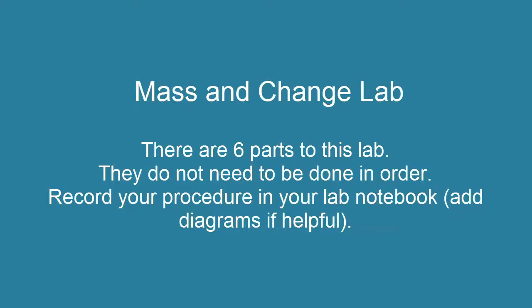This is the pre-lab for the Mass and Change lab. There are 6 parts to this lab. Some of the parts may need to be started before others, so take a look at them and do them efficiently. Make sure you record your procedure in your lab notebook.